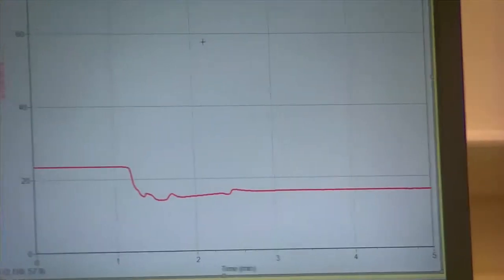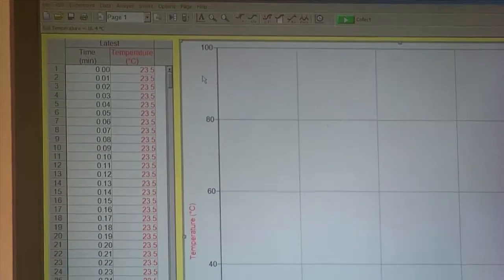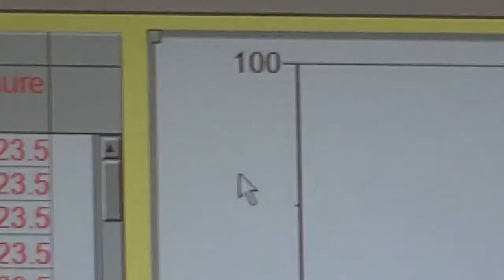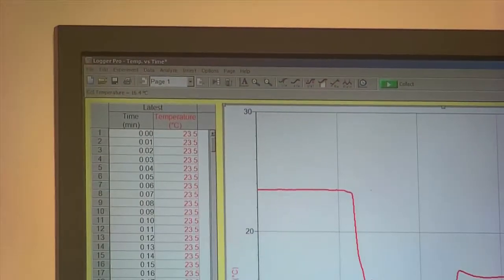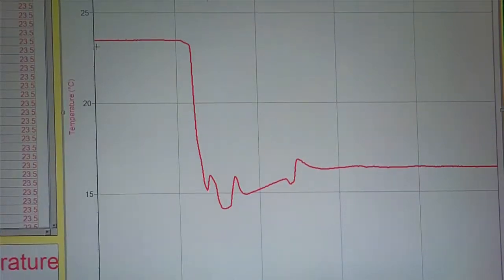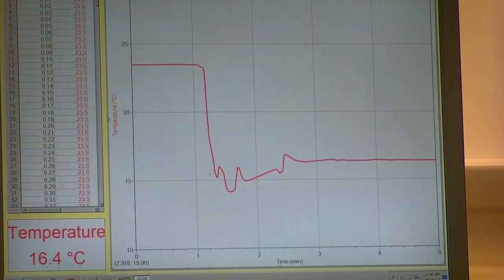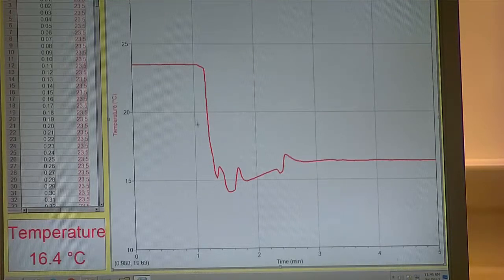That is the trajectory of my heat curve — temperature over time. I can maneuver the graph axes for aesthetics: I'll change my y-axis maximum to maybe 30 and minimum to 10. Here you see the shape of my curve. You kind of want this smooth. The reason this is not smooth was because of the jerky motion and delay in dumping the sodium nitrate. You are asked to do this twice, so when I do it a second time I'll be extra careful to make the descent more smooth.